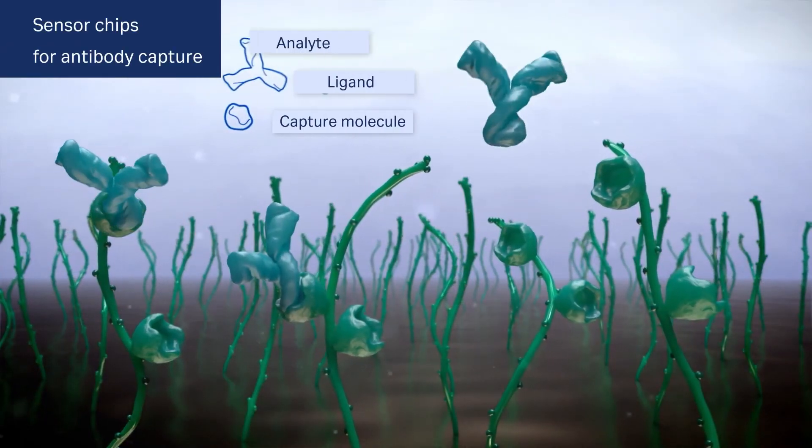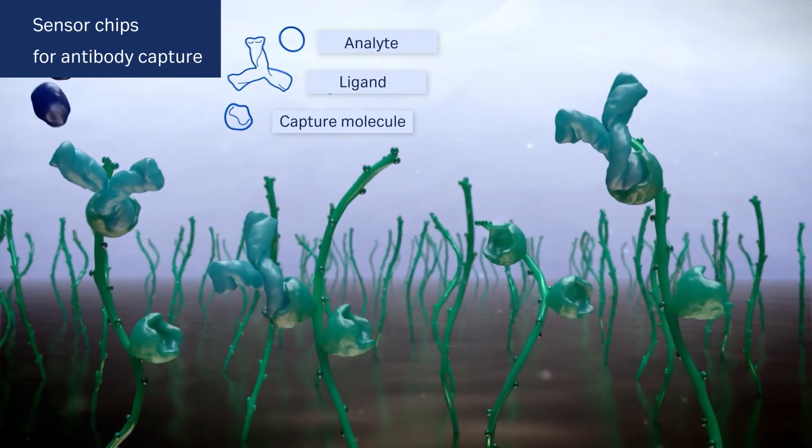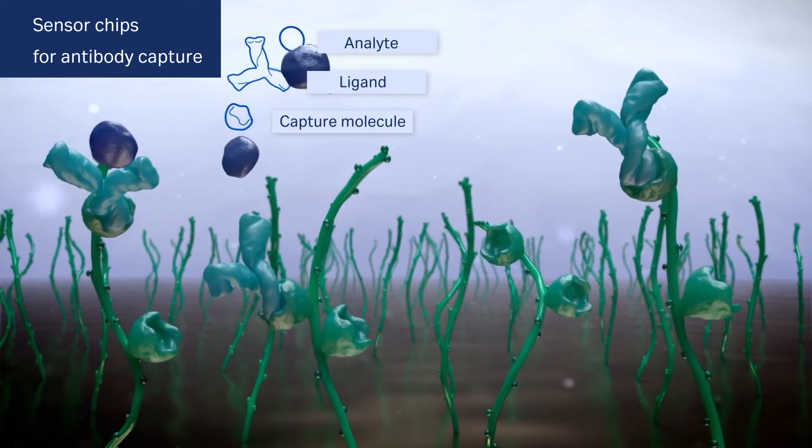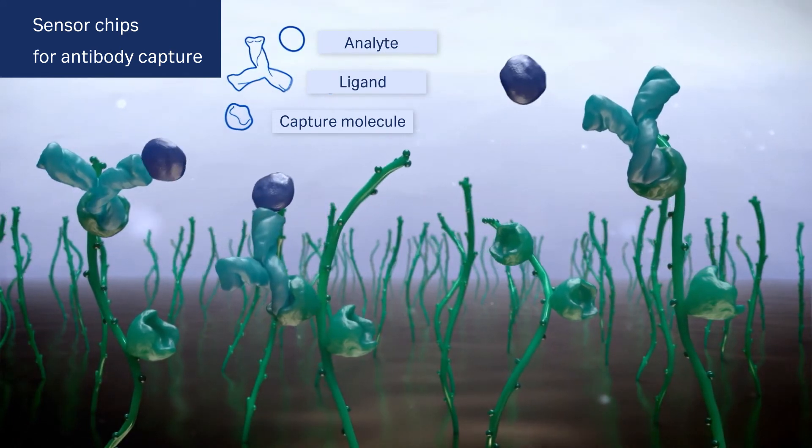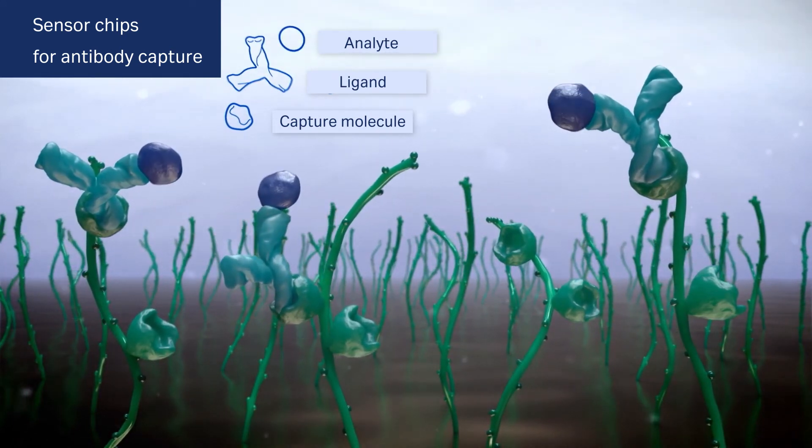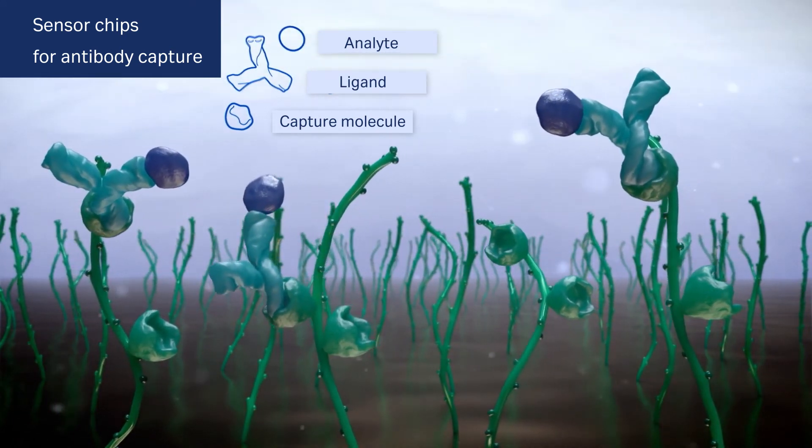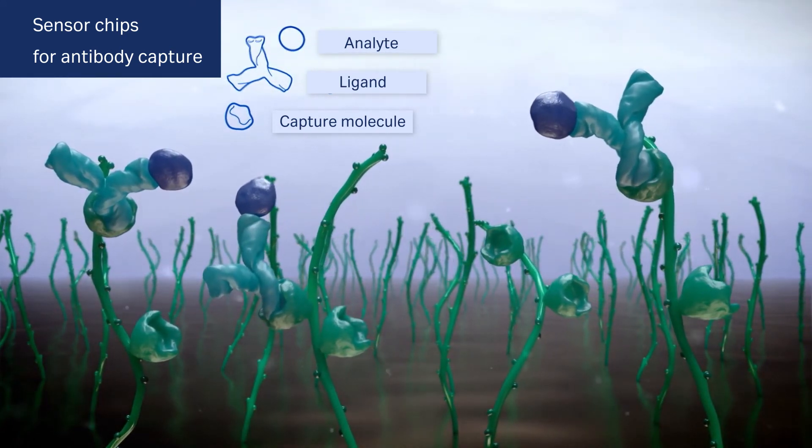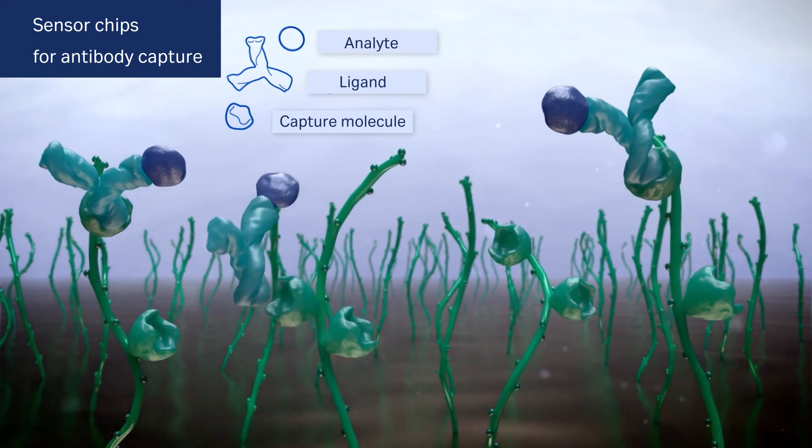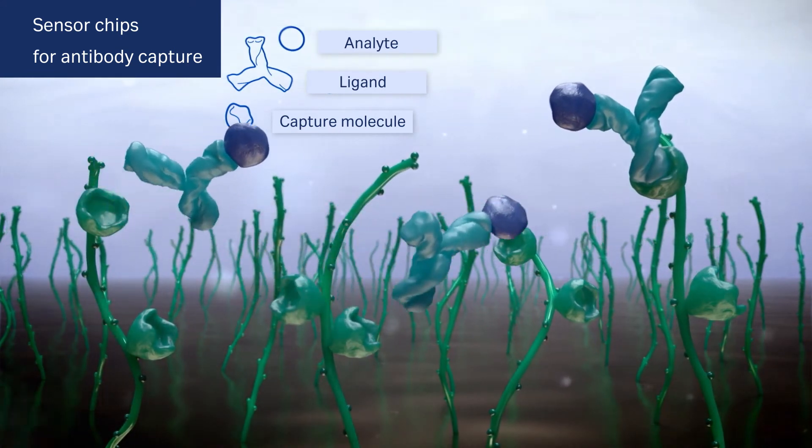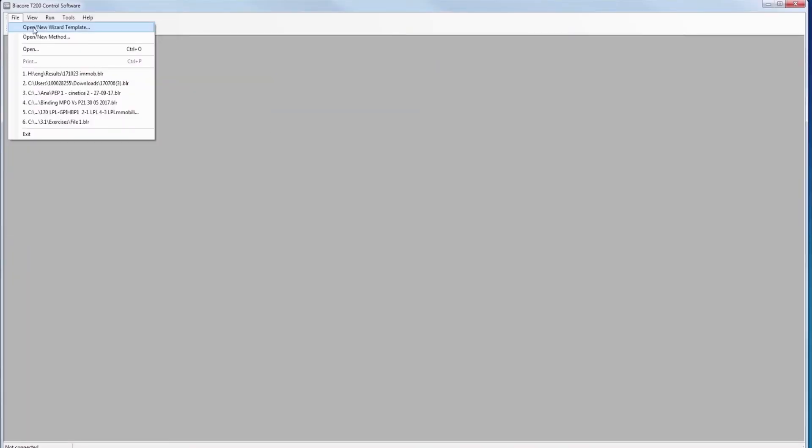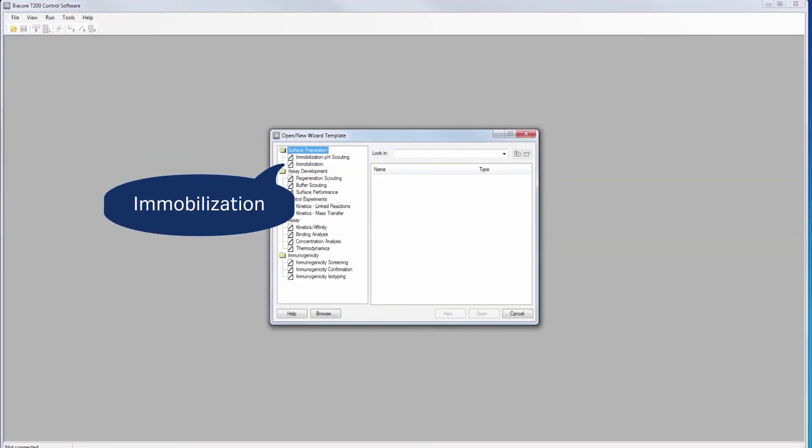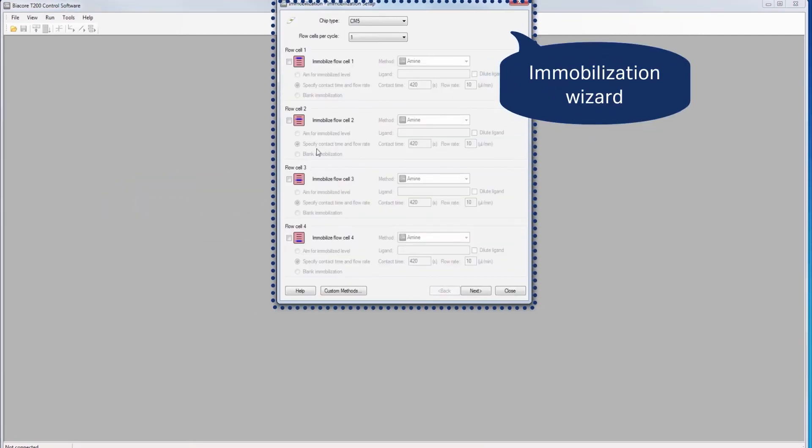Pre-immobilized sensor chips protein A, G and L allow the capture of different antibodies. Sensor chip SA is pre-immobilized with streptavidin and ready for use with biotinylated molecules.